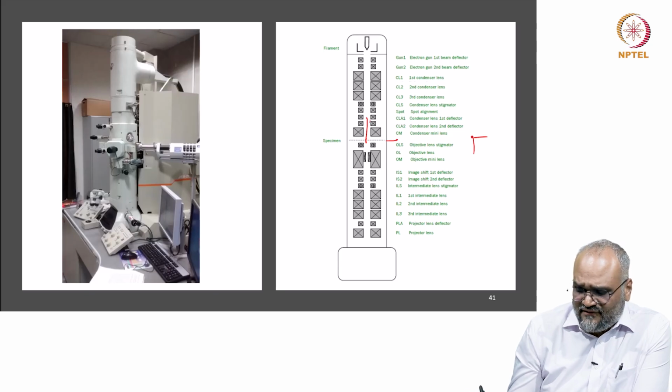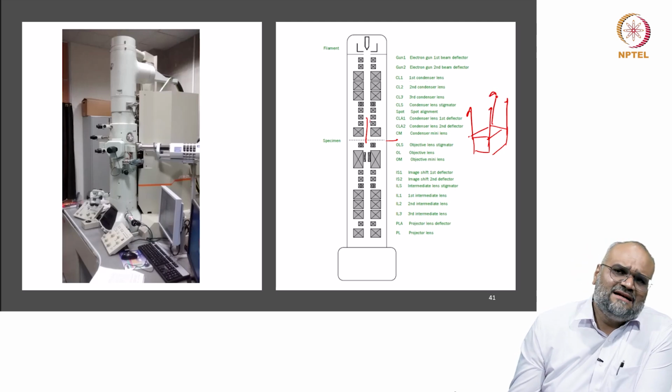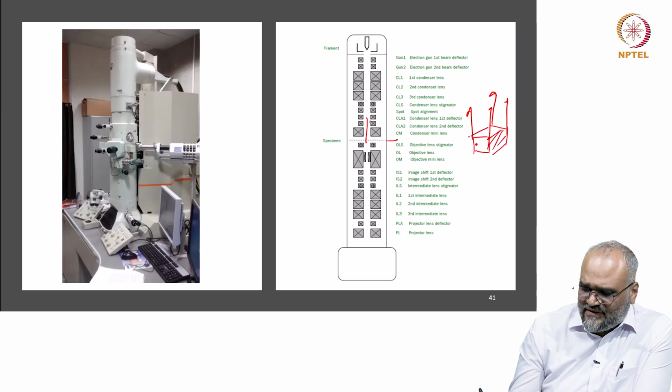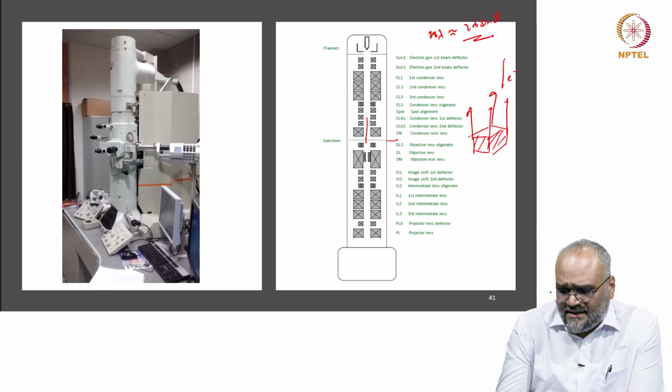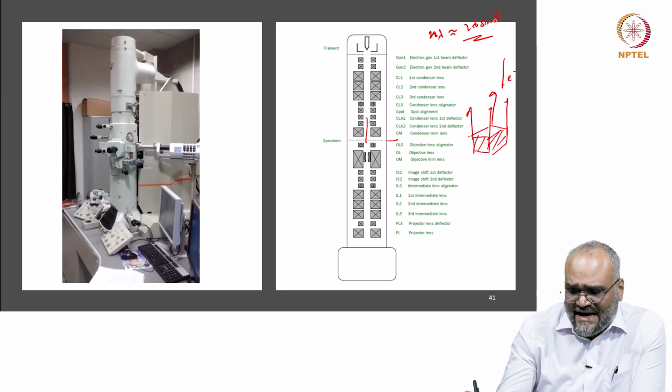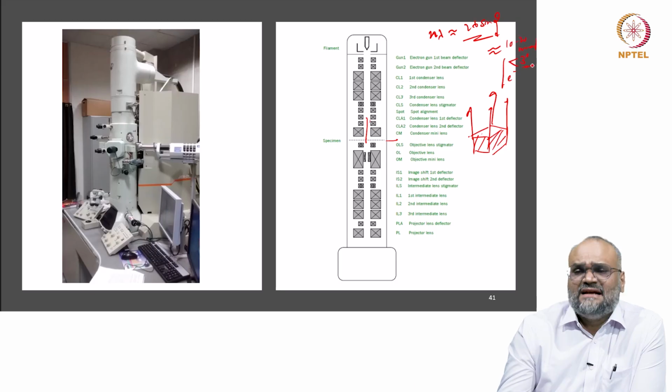That means if here is my unit cell within a crystalline specimen that is being imaged, if I orient the grains or the crystal in a direction such that one of the crystallographic planes is actually parallel to the electron beam, in this condition I am actually satisfying Bragg's law. For the electron beams in the microscope, the angle of scattering is extremely small, of the order of 10 to 20 milliradians, or typically less than 3 degrees.